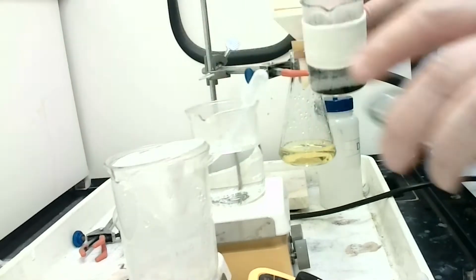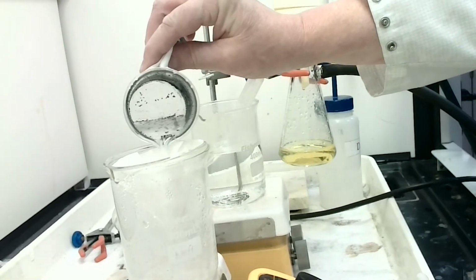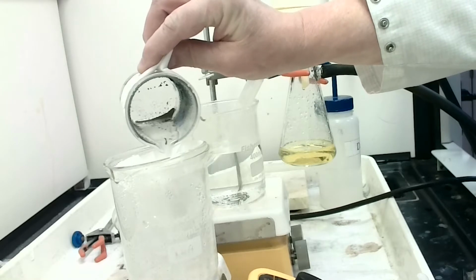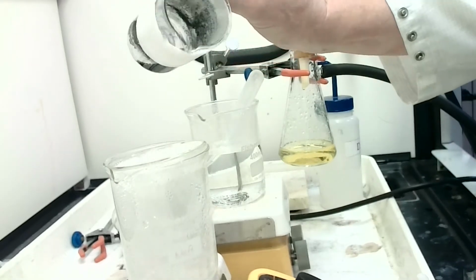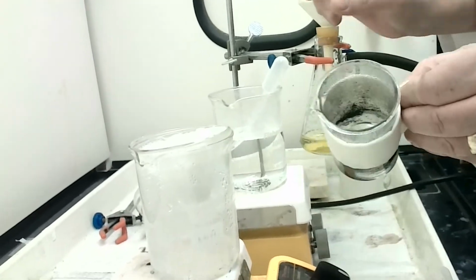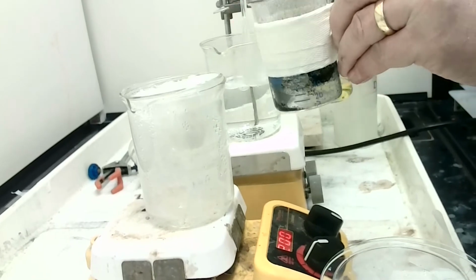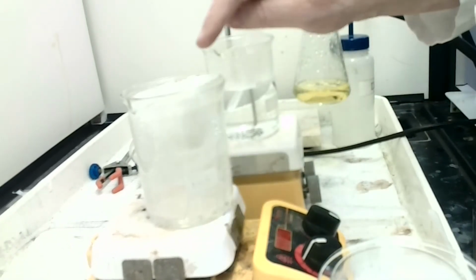One of the hardest parts of this lab is that as soon as the water cools off just a little bit, our crystals immediately start forming. And you'll see that our liquid is basically colorless, as Professor Amor said. You want to look down inside? Can you see inside of here?